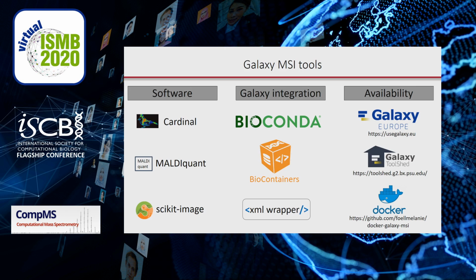For each Galaxy tool, a wrapper was created to define inputs, outputs, and parameters to build a graphical user interface. All MSI tools are installed on the European Galaxy server and available in the Galaxy toolshed as well as a Docker container.